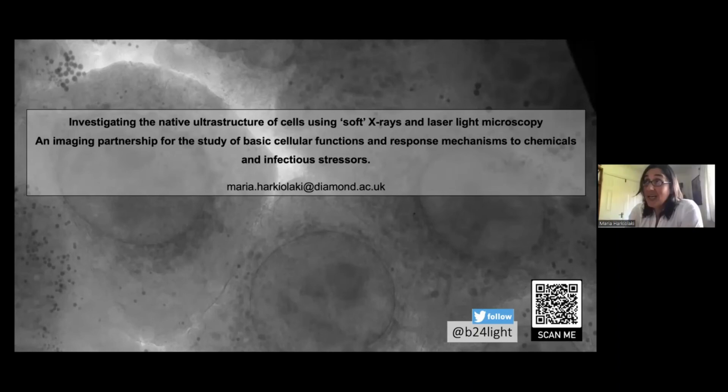We have done a lot of work with a couple of groups on neurons, one that was focusing on Alzheimer's. We've recovered neurons, putting them on feeder layers. It takes a long while, and most of the time it doesn't work. They don't recover their physiology, they don't look as happy as I would like them to, but we have worked with those, yes.